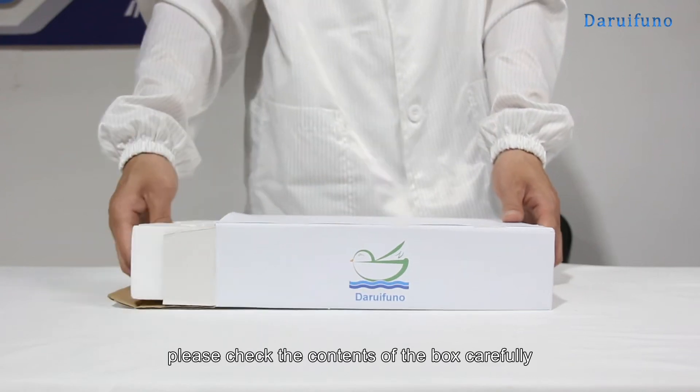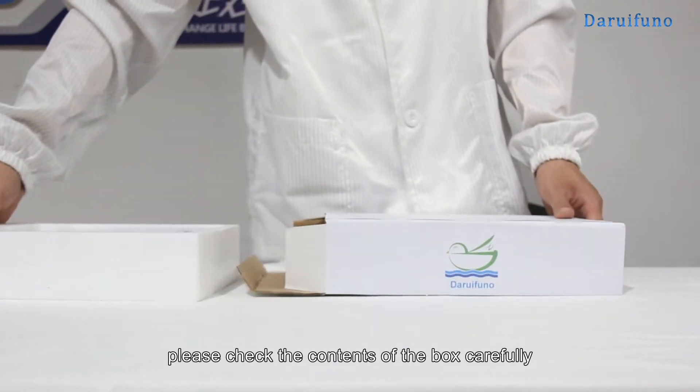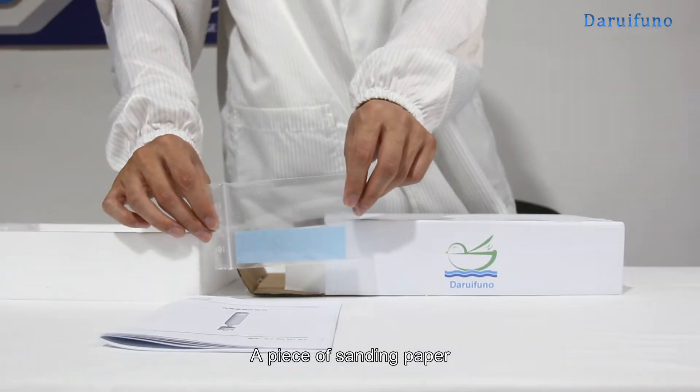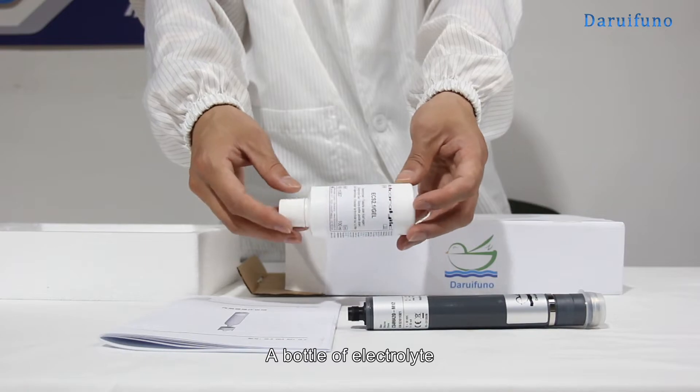After opening the box, please check the contents of the box carefully. The list is as follows: a manual, a piece of sanding paper, one electrode, and a bottle of electrolyte.